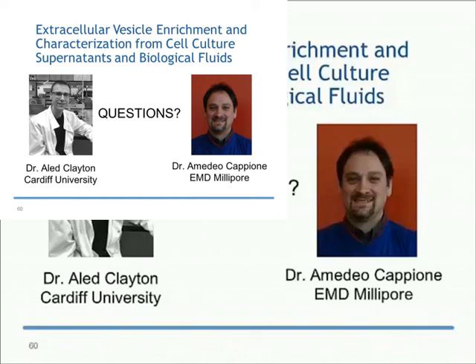Wow, that's a great question. We know when you isolate certain cell types with antibody-coated beads, for example, you can get cellular activation, and it's very much antibody-dependent, depending on which receptors are being cross-linked. In terms of exosomes, I don't know. I can imagine you're going to have a kind of receptor signaling change in the exosome vesicle. However, if you are capping proteins on the surface of the exosomes with antibodies and those antibodies remain as you add them to your functional system, it's bound to have some impact.